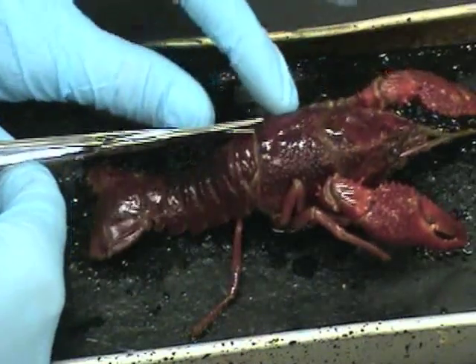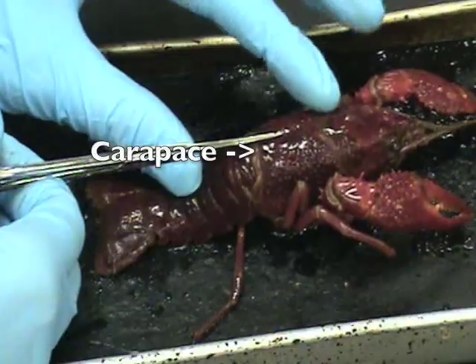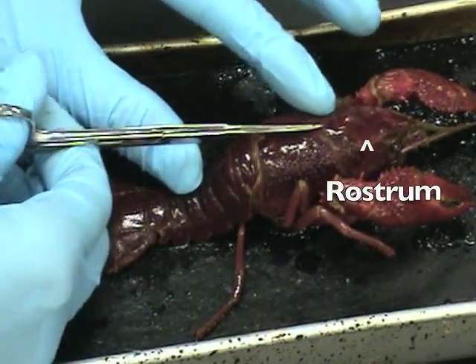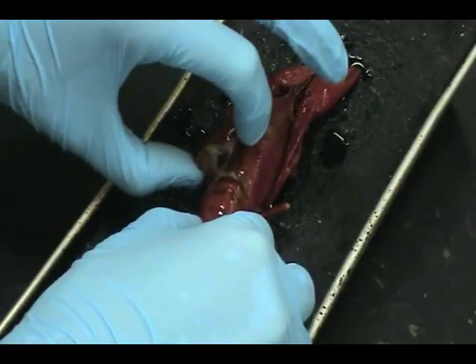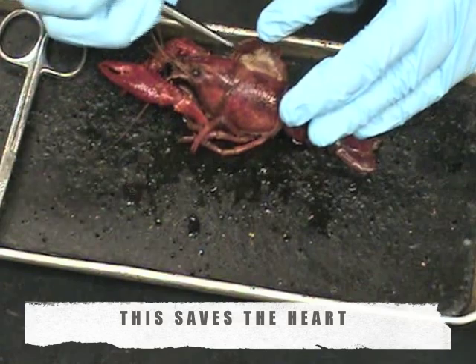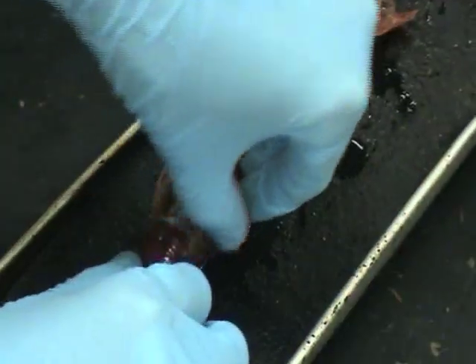Place your specimen dorsal side up. Use your scissors to cut slightly off-center from the base of the carapace straight up to the base of the rostrum. Peel back one half of the carapace and use a probe to pick away the connected membrane. That way you can rip off the rest of the carapace.